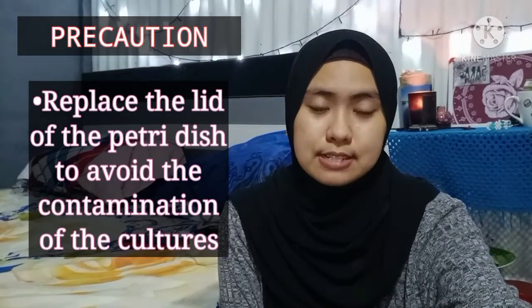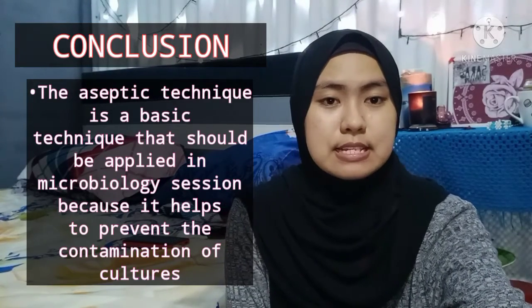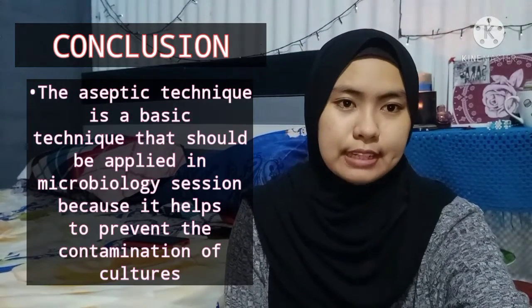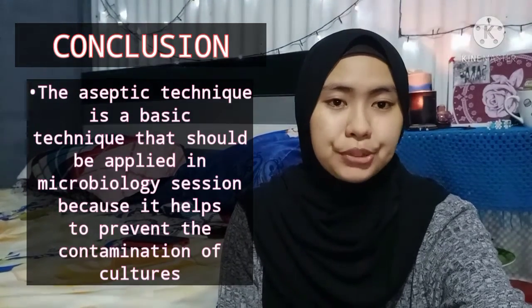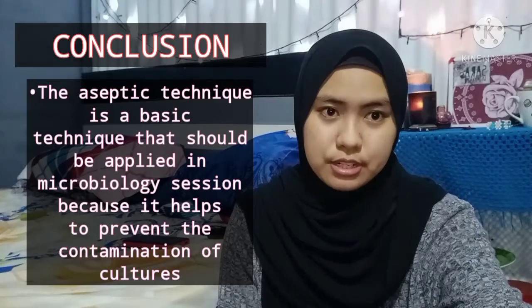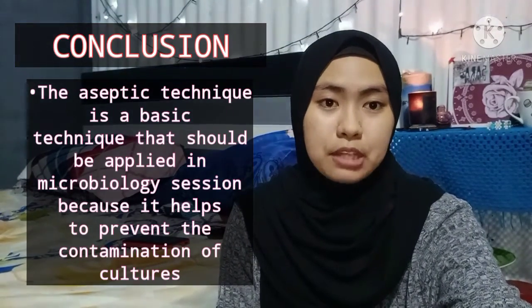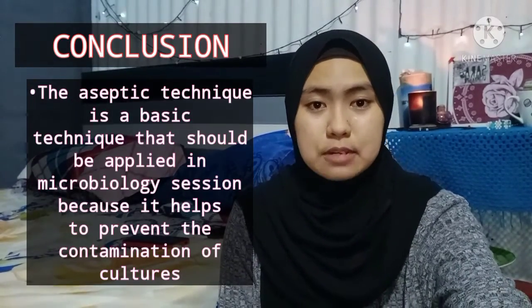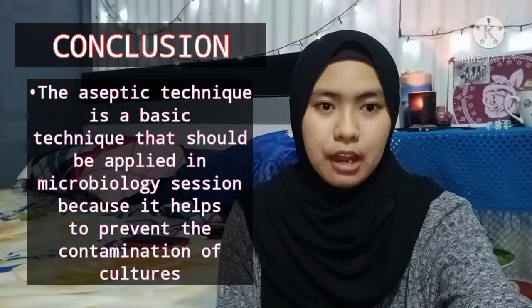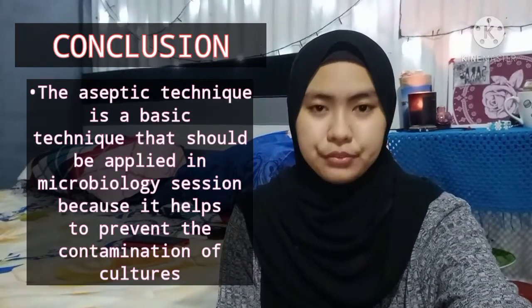from contaminating the culture. So the conclusion is that the aseptic technique is a basic laboratory technique that should be applied, especially during microbiology laboratory sessions, because it helps to prevent any contamination of the culture by unwanted or harmful microorganisms from the environment that can also affect the accuracy of the result.